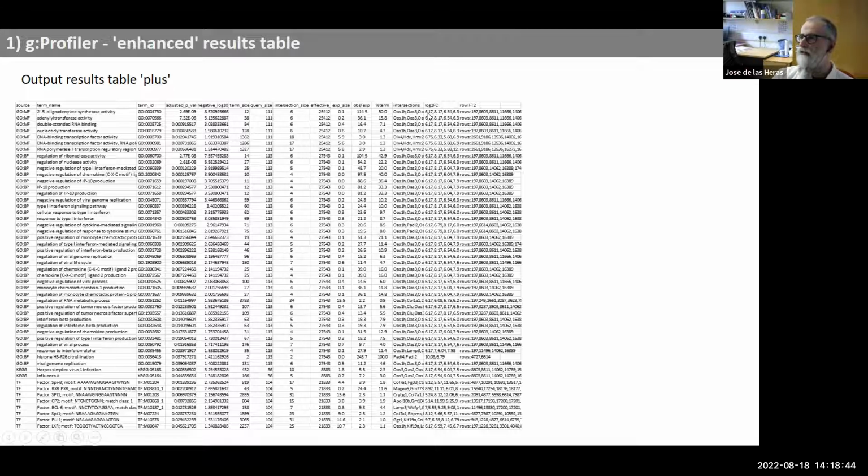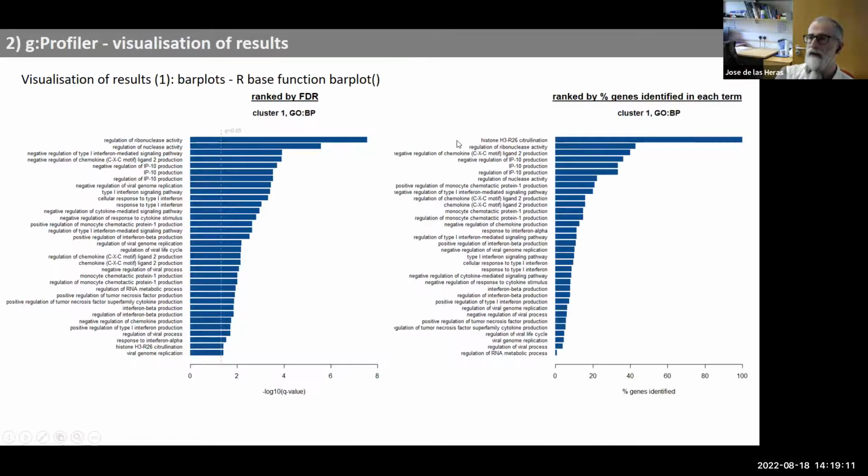conditions that I was measuring. I also have the indices, because the way I store the data tends to be a collection of tables. They're all in the same order of genes. So what I have is just the rows these genes are in. So if I want to retrieve some other data from these tables, I can just come here, easily extract it, and do more plots or whatever I want.